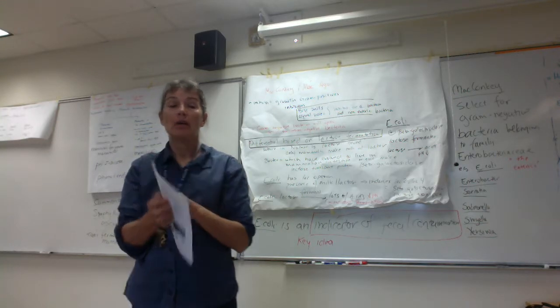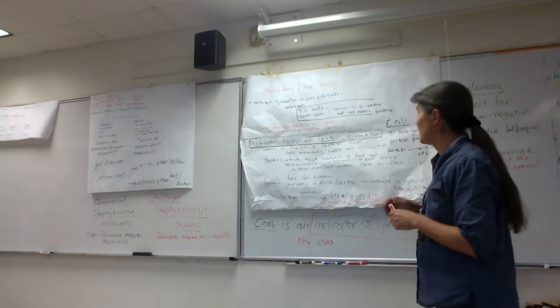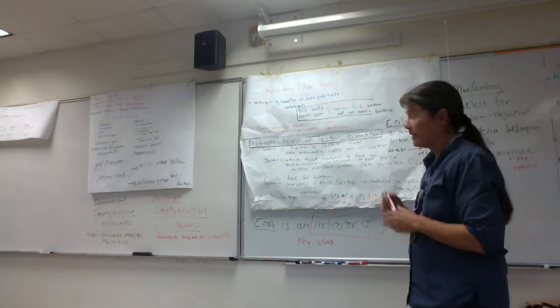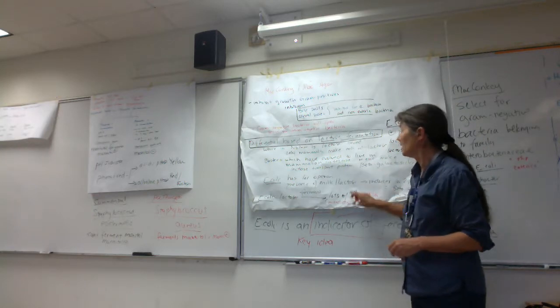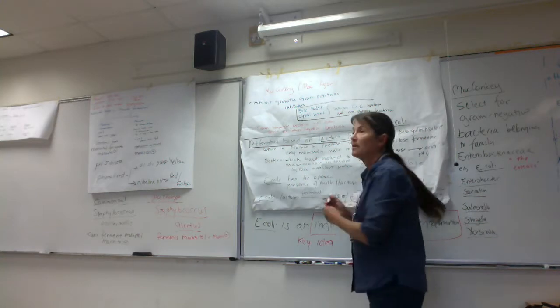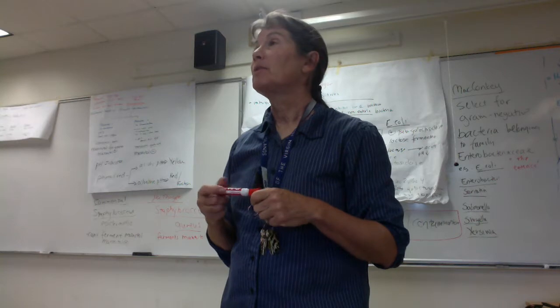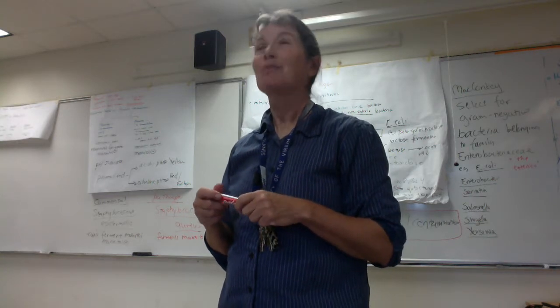So you guys, what's going to happen if E. coli or one of its cousins ferments lactose? What are we going to make? Acids, right? What will happen to the pH? pH will drop, right? What will happen to the neutral red? It turns pink or red, okay?